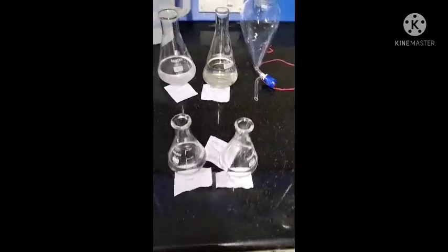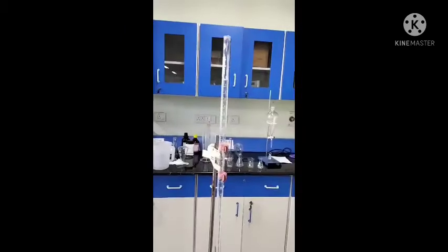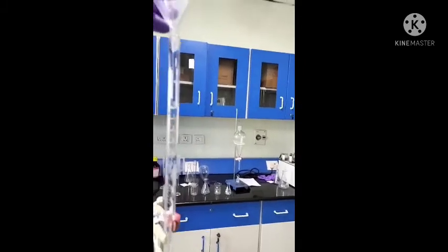Now I collect the samples from both layers and proceed to titration. I prepare 0.5 normality NaOH sodium hydroxide solution. For titration, fill the NaOH solution into the burette using the funnel.